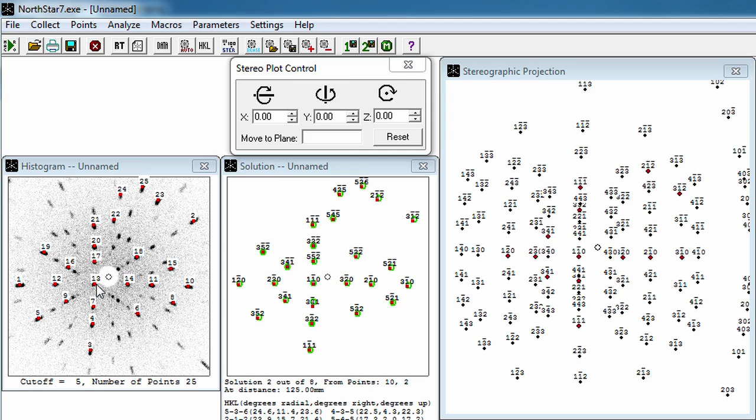Now, this is very important because on a tetragonal crystal like calcium tungstate, we cannot simply rely on the symmetry of the image like we could before on the cubic crystal. Both the 110 and the 100 have a twofold symmetry. So unless you index the crystal, you can't generally tell the difference between the 110 and the 100. But with the indexing, we can tell that unambiguously.